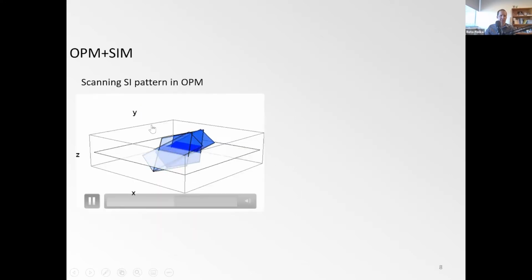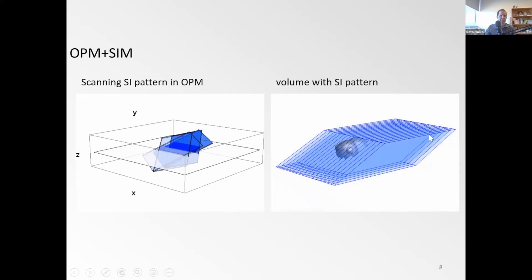Okay, and so to acquire the data, we then scan the light sheet. This has been pioneered by the group of Elizabeth Hillman, how to do that quickly, and also by others. Manish Kumar also published very neat mechanisms by which, without moving any heavy objects like the sample or the objective, you can very rapidly scan the light sheet. And as such, you can then acquire a volume under structured illumination. Notice it's not square, it's essentially a rectangular volume, a parallelepiped. That's just how the data comes out, similar to the lattice light sheet.